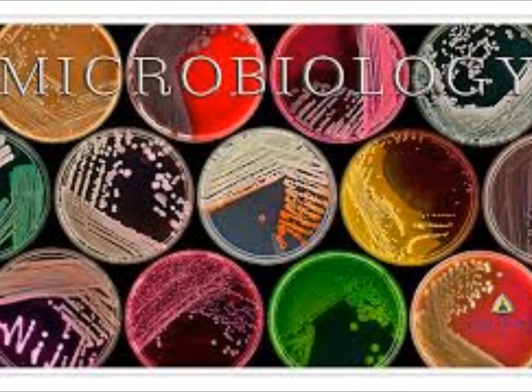If it didn't change, you don't have to write out lactose fermenter. It's just LF or NLF. It's not clear, but it's beige or buff. It did not absorb that dye, it didn't turn pink. It would have to be pink. Here's the example of the lactose fermenter versus non-lactose fermenter. The lactose fermenter took up the dye very well, it's pretty pink. The other one is not clear, it's kind of a palish pink because the media is a pale pink.